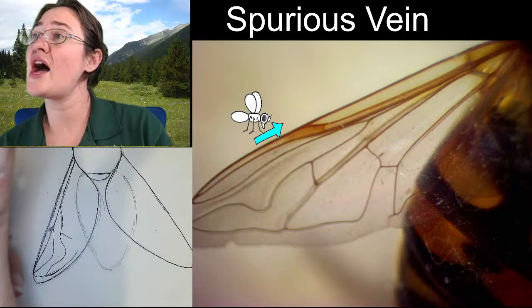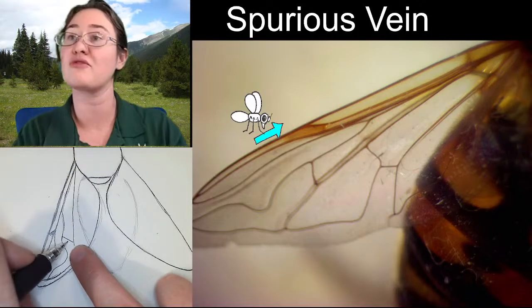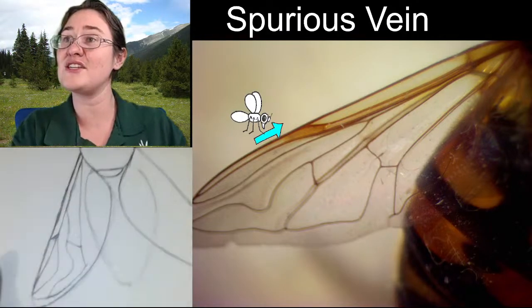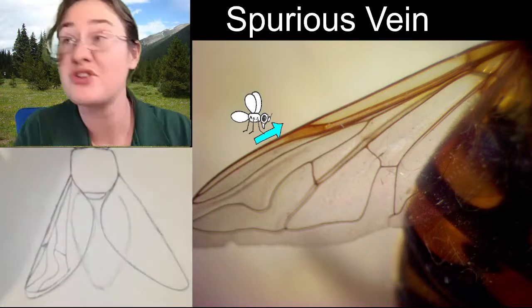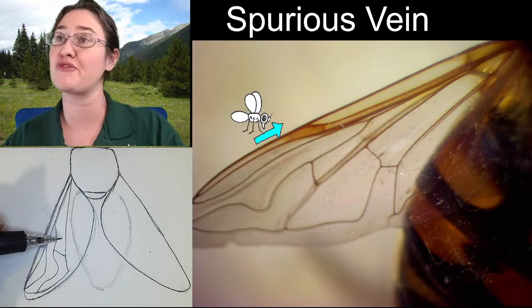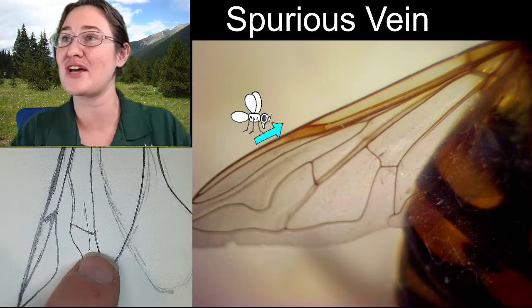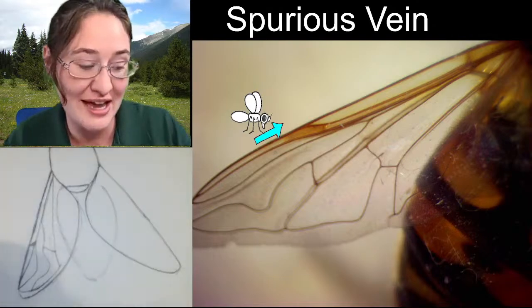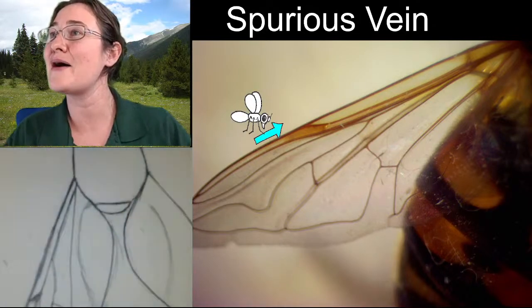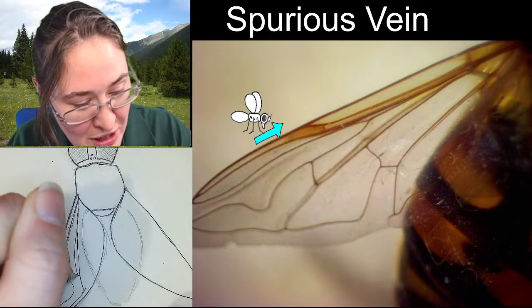All right, so our next vein is going to start at the base here, and you want it to reach out and hit right underneath this cross vein and then come down. Now, this is where your spurious vein is going to be. In some species, the spurious vein comes out of nowhere and goes to nowhere. Sometimes it's just a little vein right here that doesn't touch anything. And when it's like that, it makes me laugh, because it's like, what was your point? But on this guy, it does seem to connect to this vein and run almost parallel and then disappear.